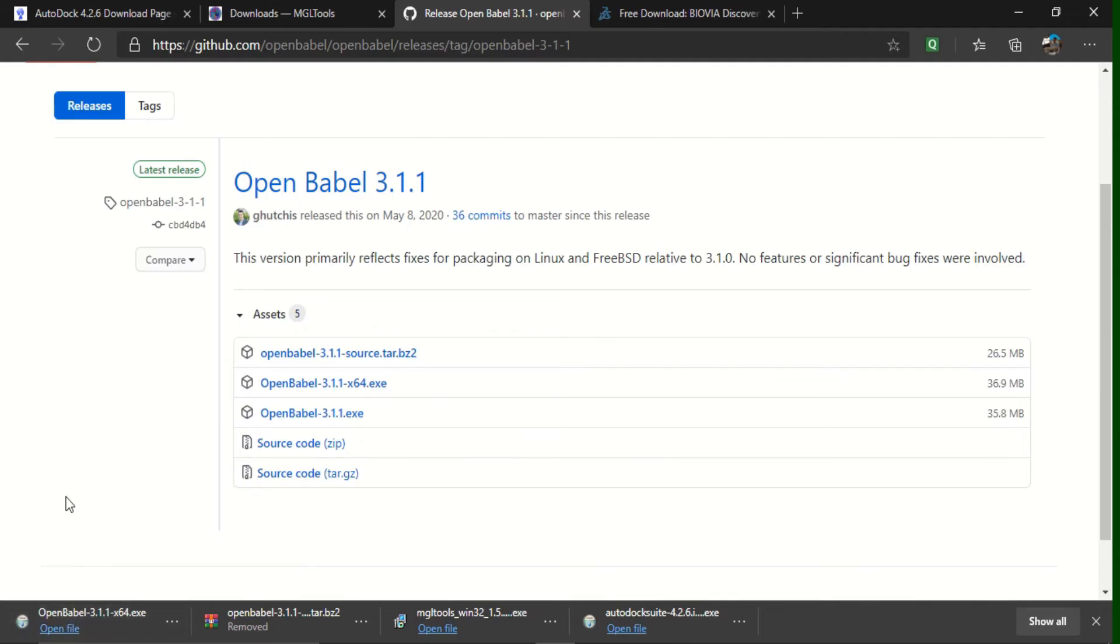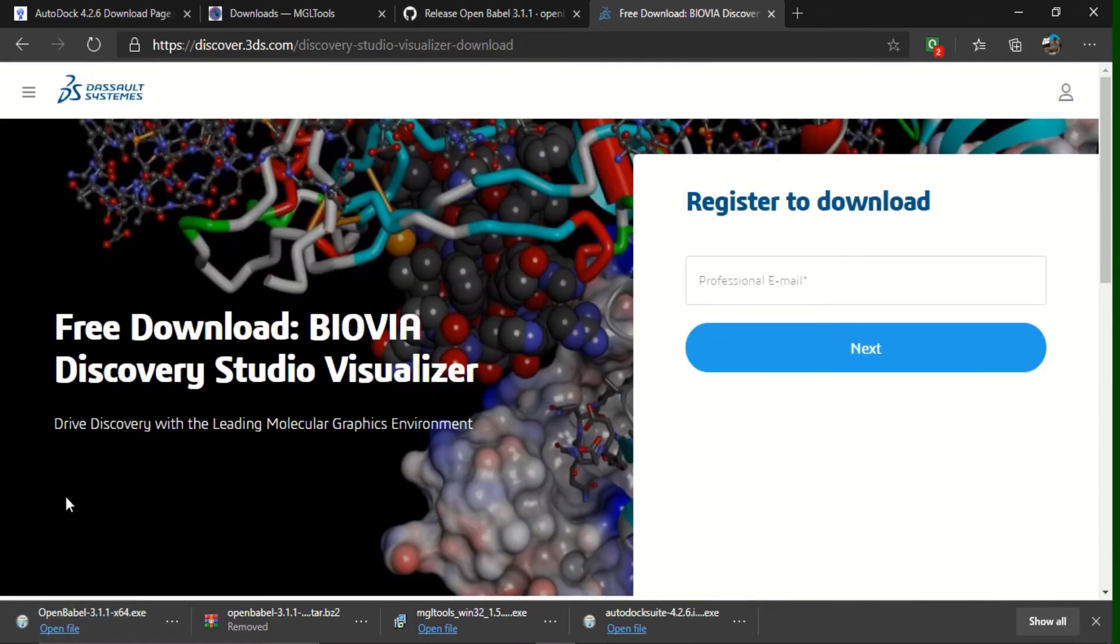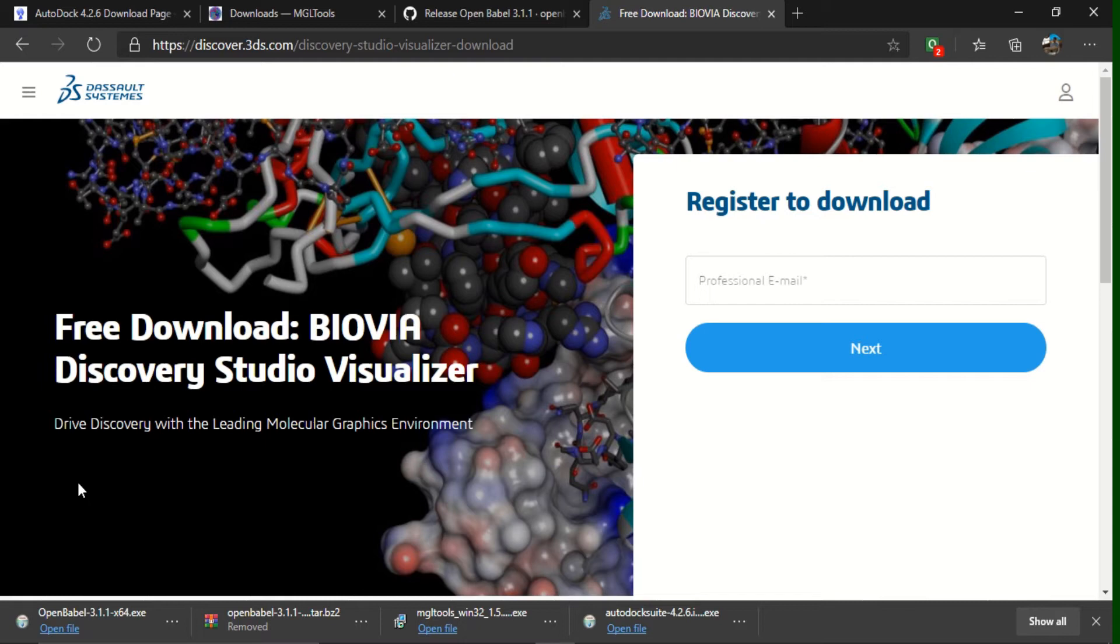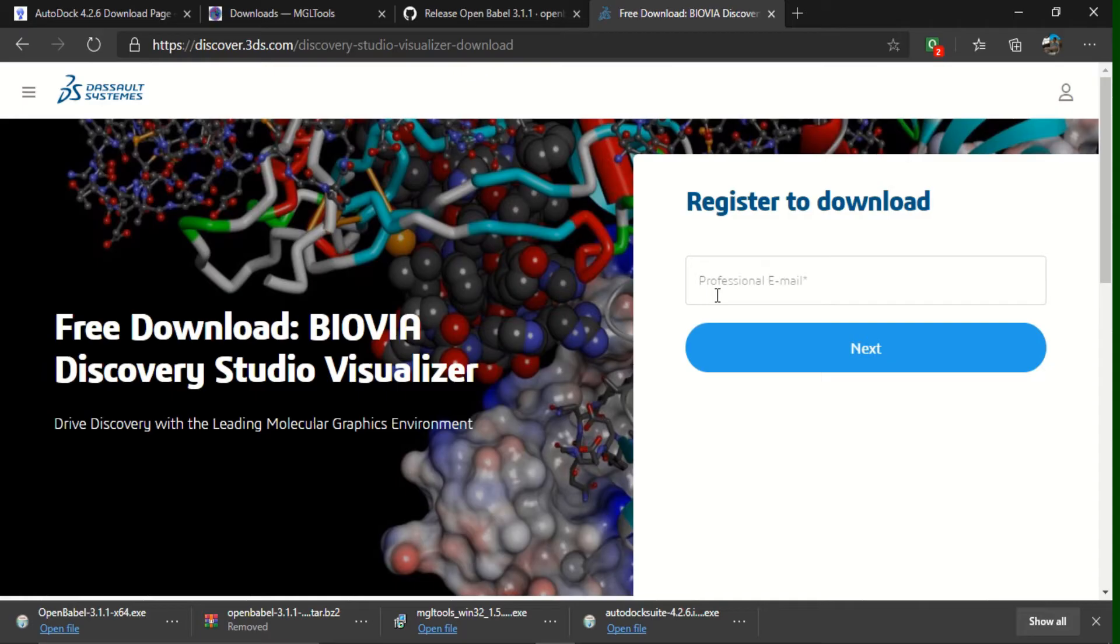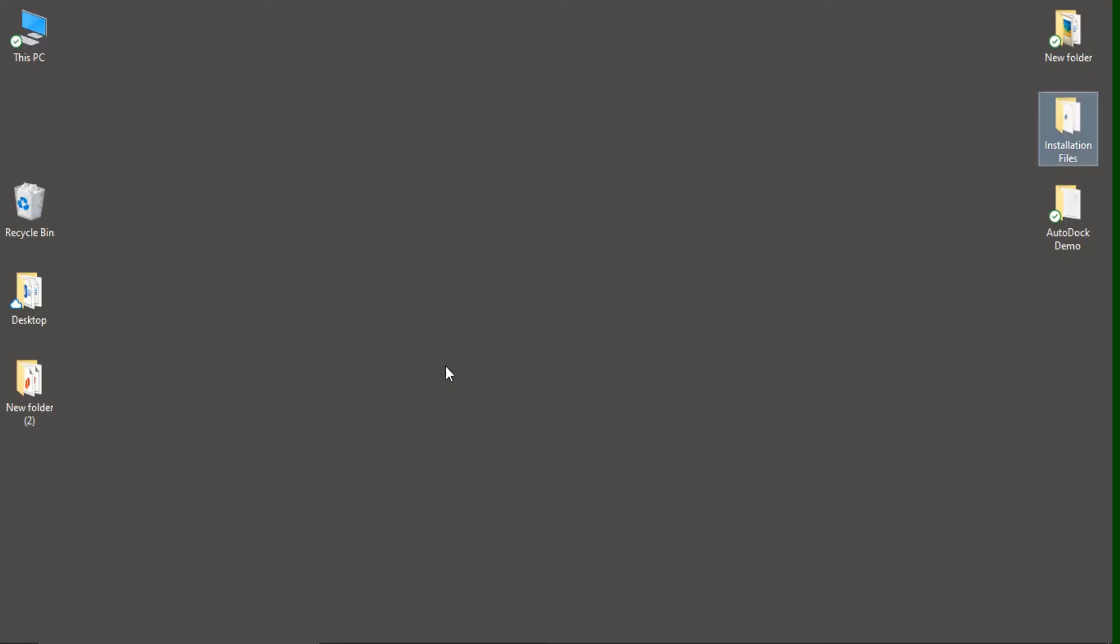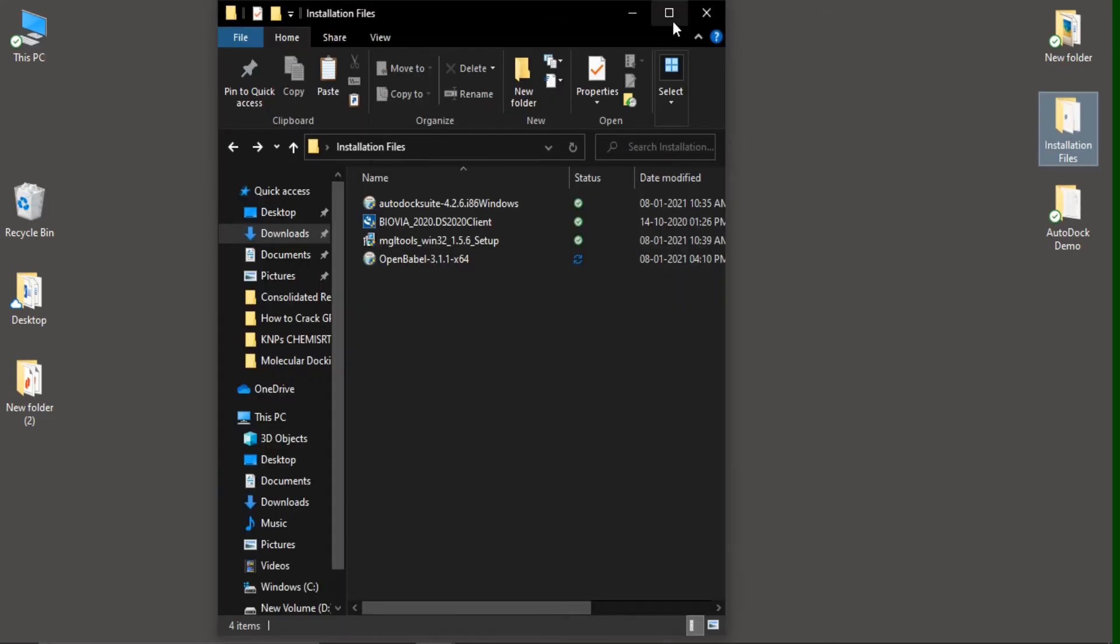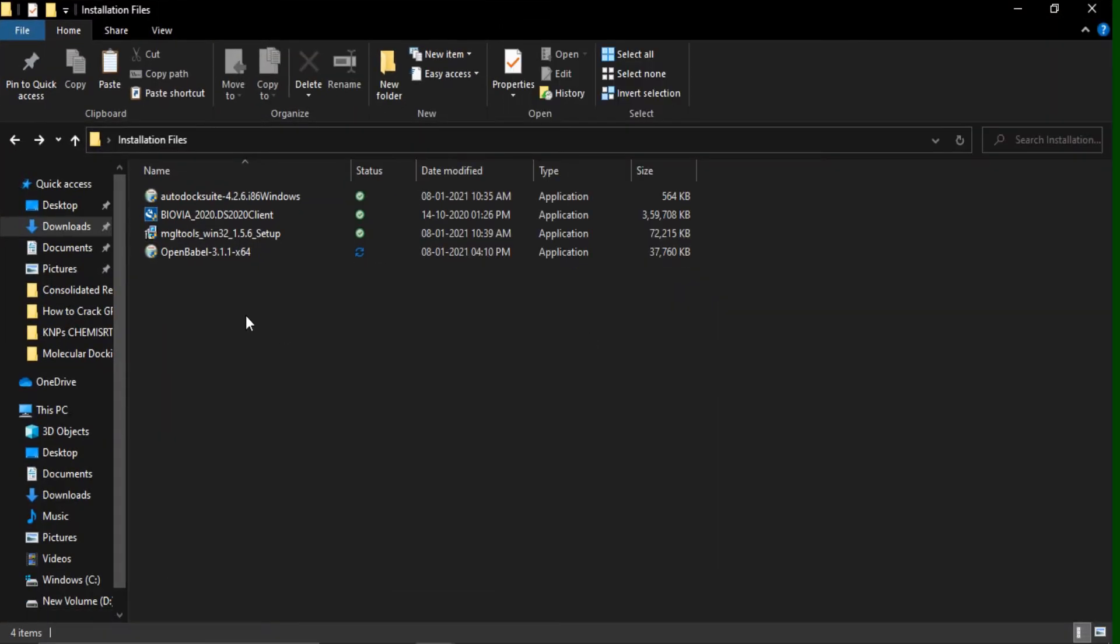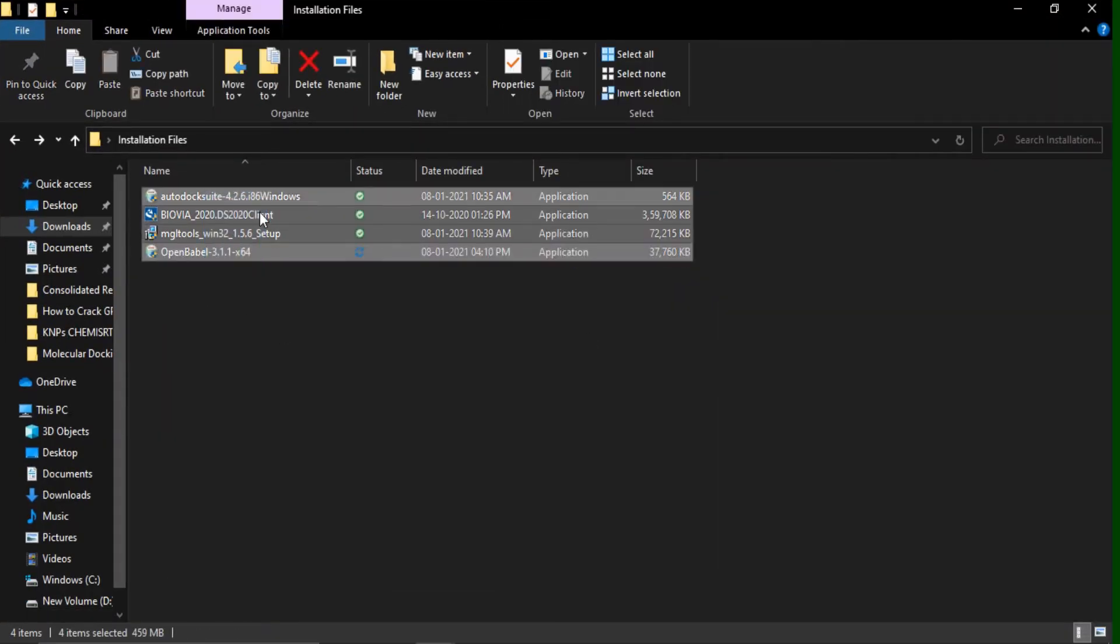And at last, the fourth resource what we are going to use is Discovery Studio. Here, for downloading this Discovery Studio, you need to give your email address. After that, you need to fill a small form. After filling that, you will get a downloadable link from which you can download the Discovery Studio. Here, I have already downloaded all four softwares.